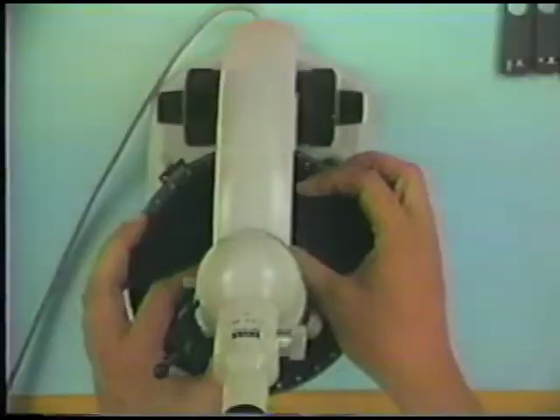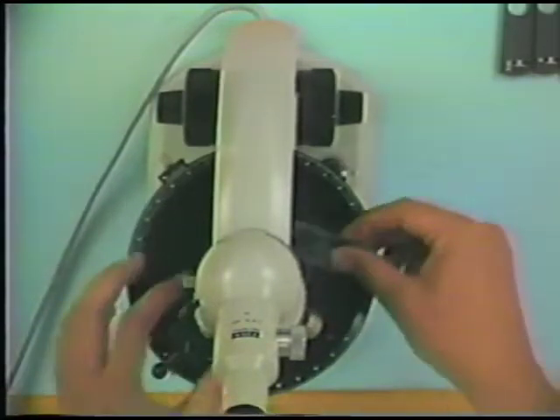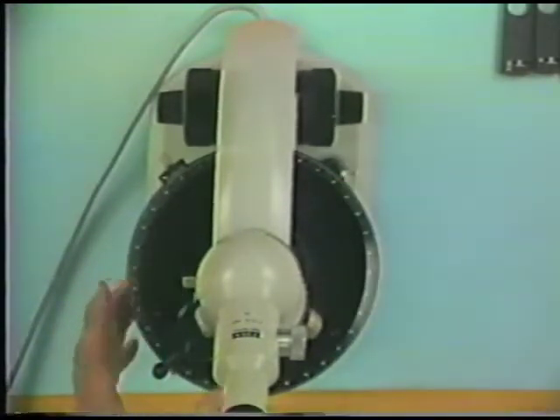Now, knowing the birefringence of the mineral grain is important, and of course it's influenced by the thickness of the thin section. But if we know that, then we know what kind of immersion oil to use as our guess for the epsilon refractive index. If it's a low or weak birefringence, as it is in this particular case, then we know that the immersion oil we're going to use to test the E-ray is not very different than the immersion oil that we use for the O-ray. Well, now I'm going to move to a different mount, this time a mount of an orthopyroxene.